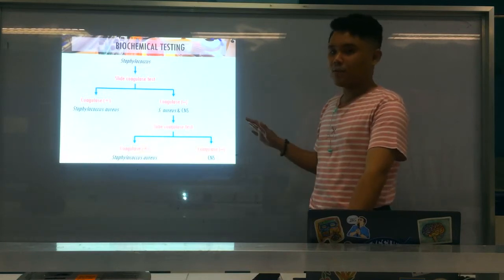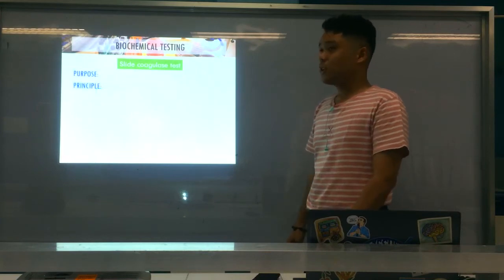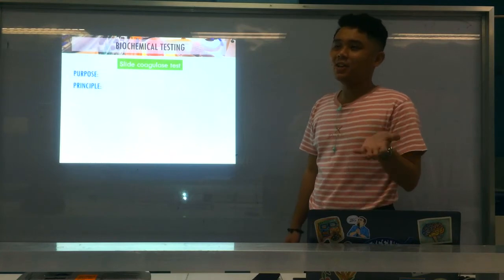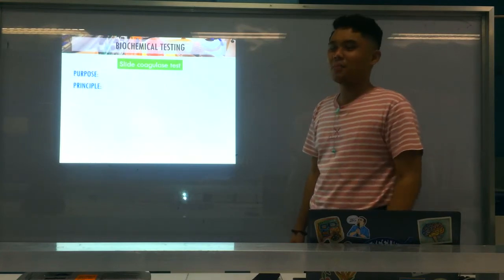Alright, so we'll now go to the different principles of this test. So for the first one is of course your slide coagulase test. Again, according to Mahon, it is no longer trusted. It's an obsolete method already. It is no longer performed.